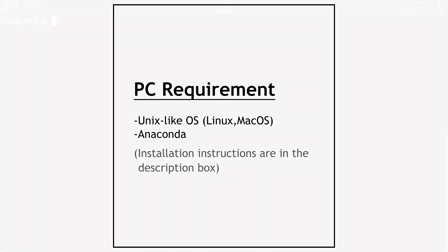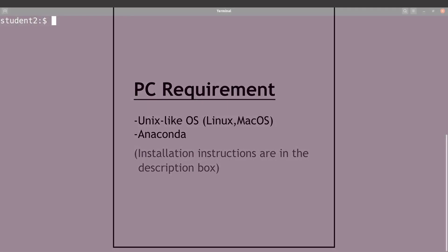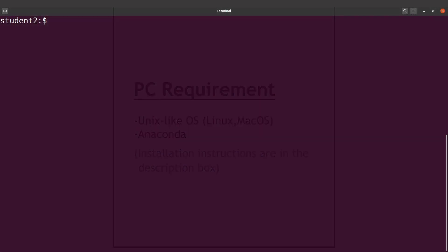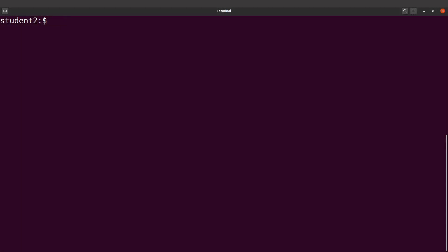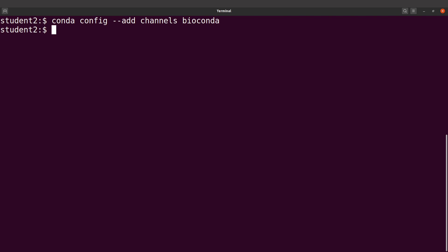First of all, install Anaconda as I just mentioned, and then the next thing you have to do is to add channels. Let's add the two channels - we're adding conda-forge and bioconda. We type conda config --add channels, let's add the first one bioconda, and let's add the second one which is conda-forge.